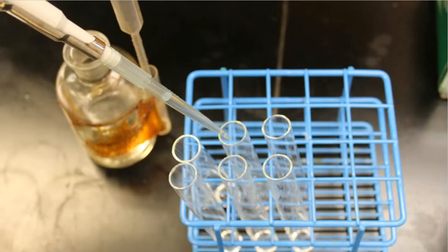Folks, do you see what we're doing here? Think about the benzene reactions that we've done. And the benzene reaction that we are focused on in this experiment is the addition of nitric acid with sulfuric acid written above the arrow. That is the reaction that we are doing, which means that this is nitration. We're going to be taking these benzene rings that we're using in the lab together, and we're going to be nitrating them, which means an NO2 group is going to go on to the ring of these structures that I am using in the very beginning.